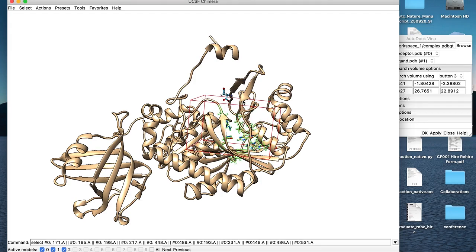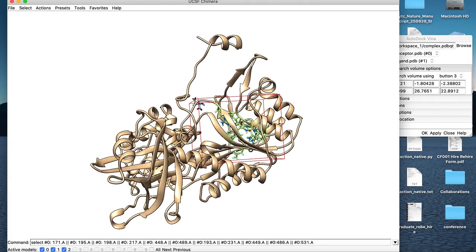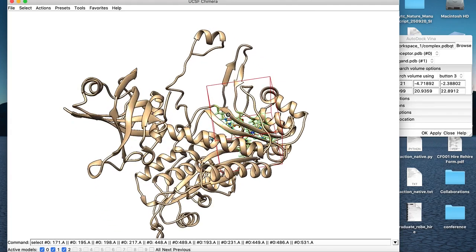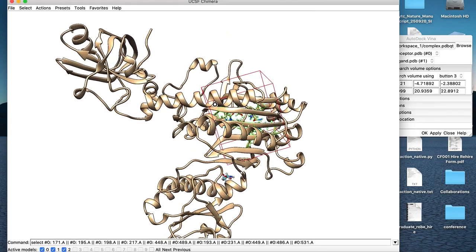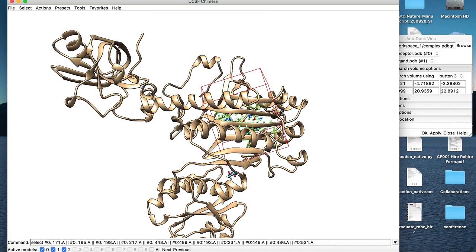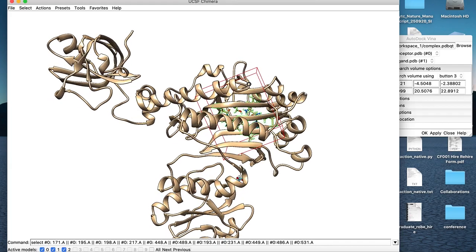And then you adjust this edge here slightly. And then go in this direction as well, and this one. Okay. And a bit more here. So you see, precision is very, very important, and you want to be as precise as possible. So I guess we are nearly there, and we should be happy enough with this.